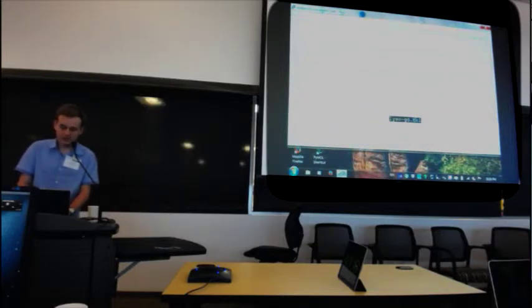I see that now it's going very slowly because we are clogging up the queue.